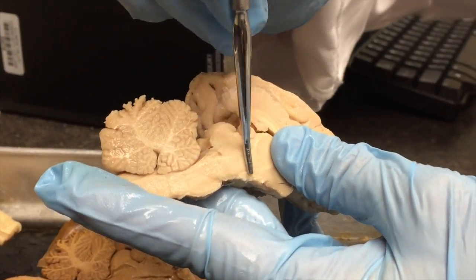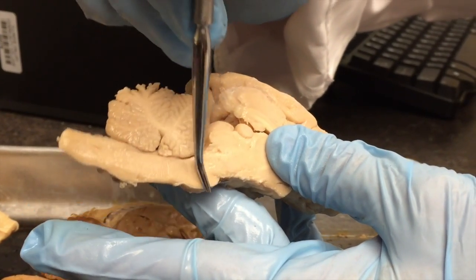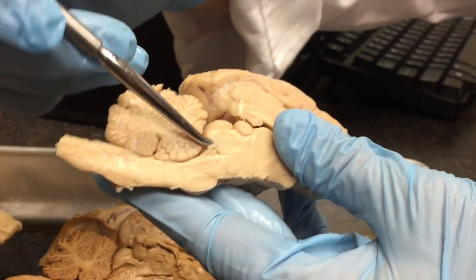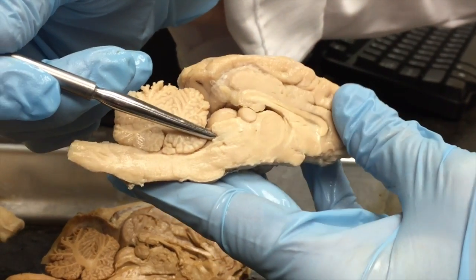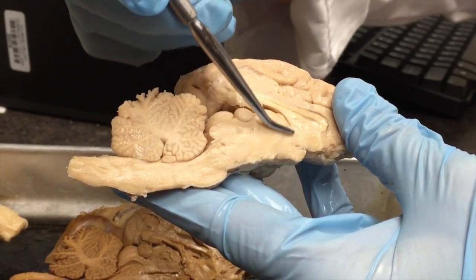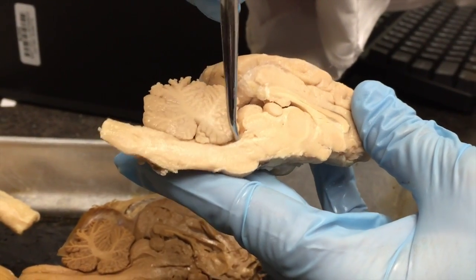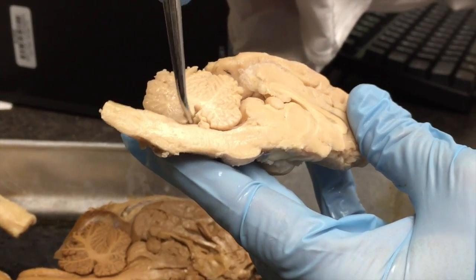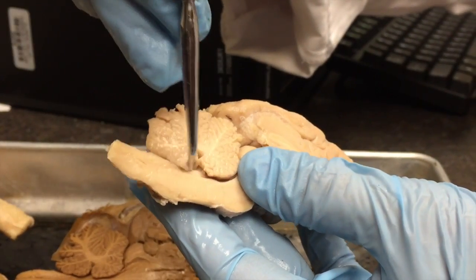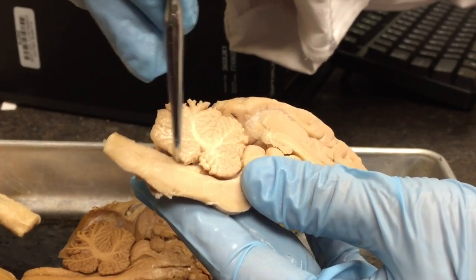So our cerebral peduncles are here. Here is the very small pons, and here is our medulla oblongata. But the purpose of that cerebral aqueduct is to take cerebrospinal fluid from the third ventricle, which is where the thalamus and the hypothalamus are sitting, to the fourth ventricle. The fourth ventricle is going to be sitting below the cerebellum in the sheep brain. So right here, this little area is our fourth ventricle.